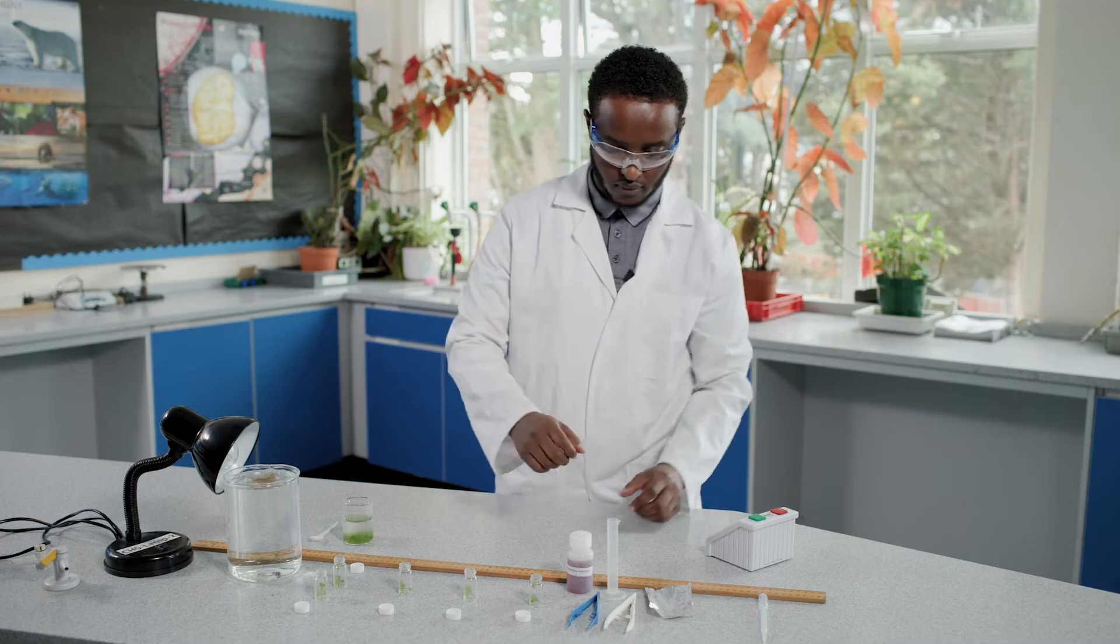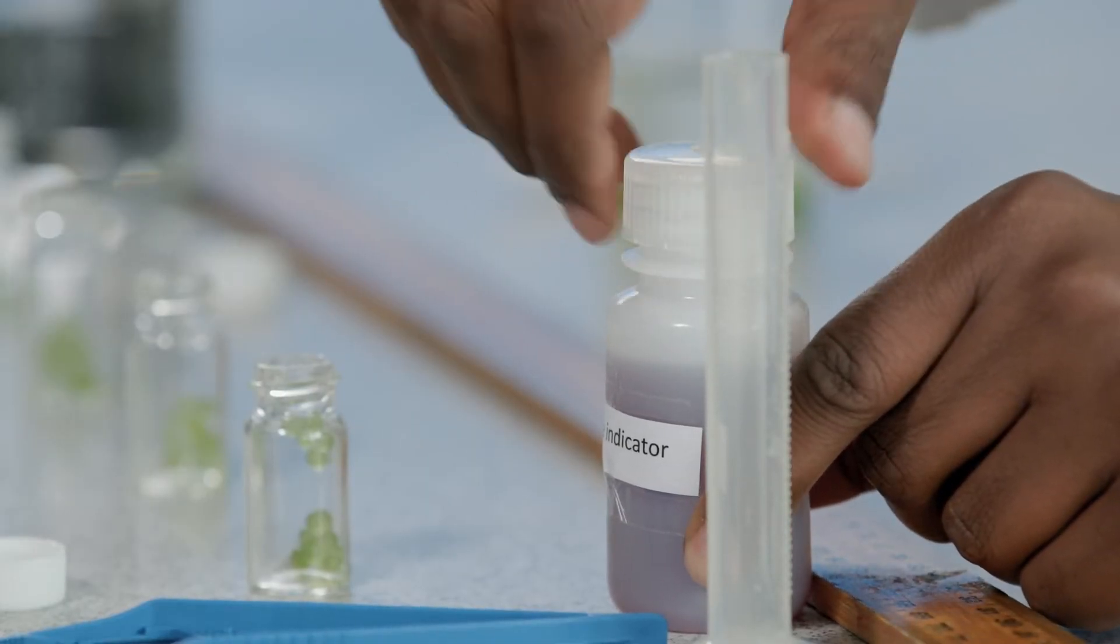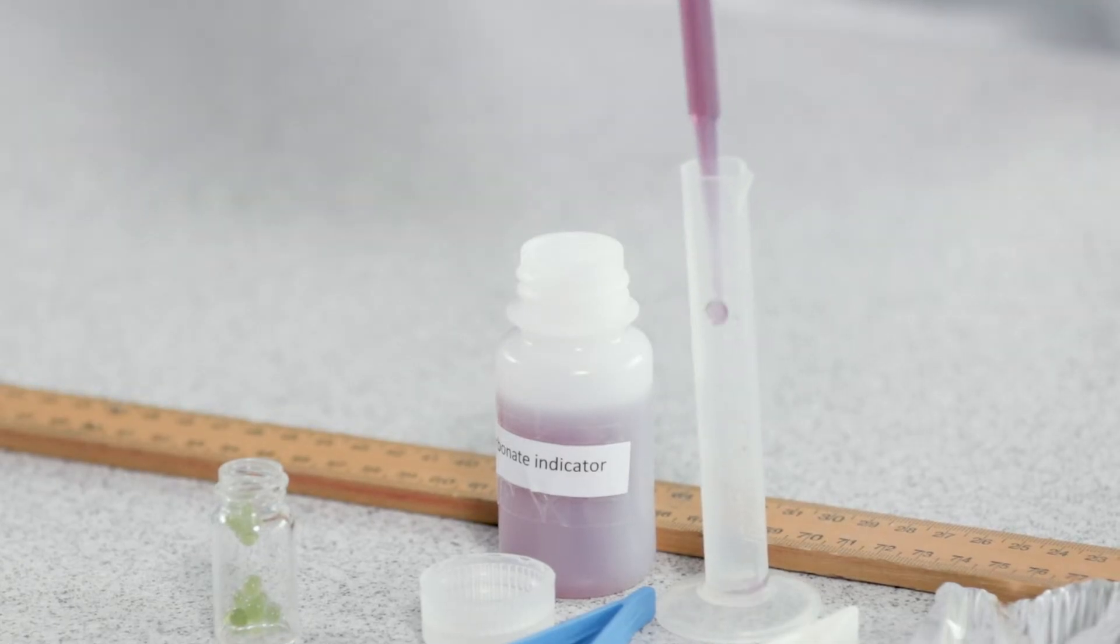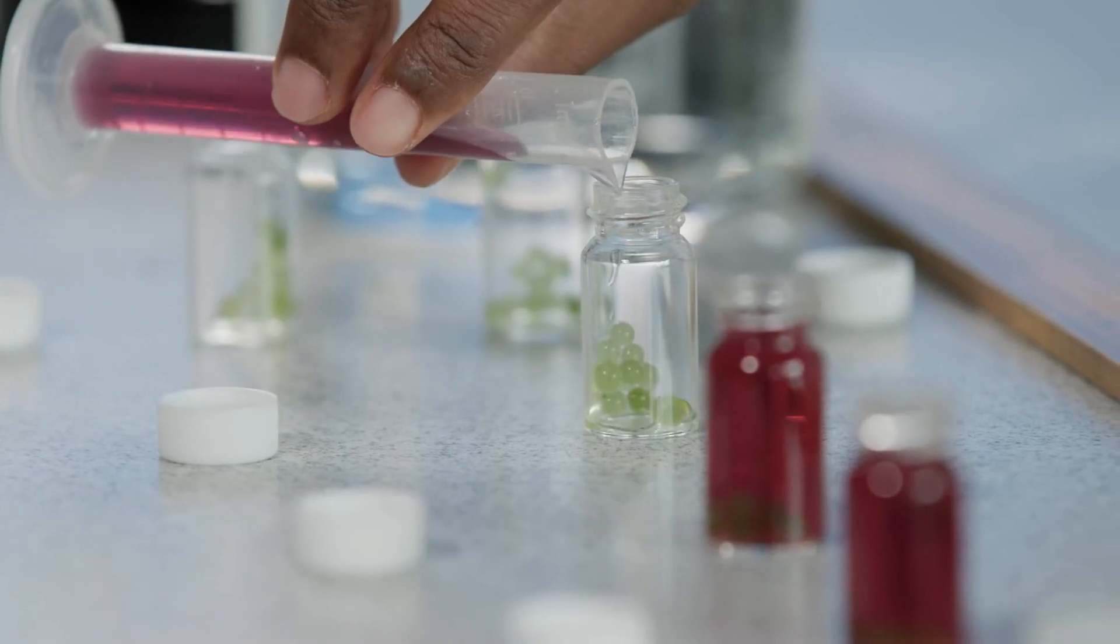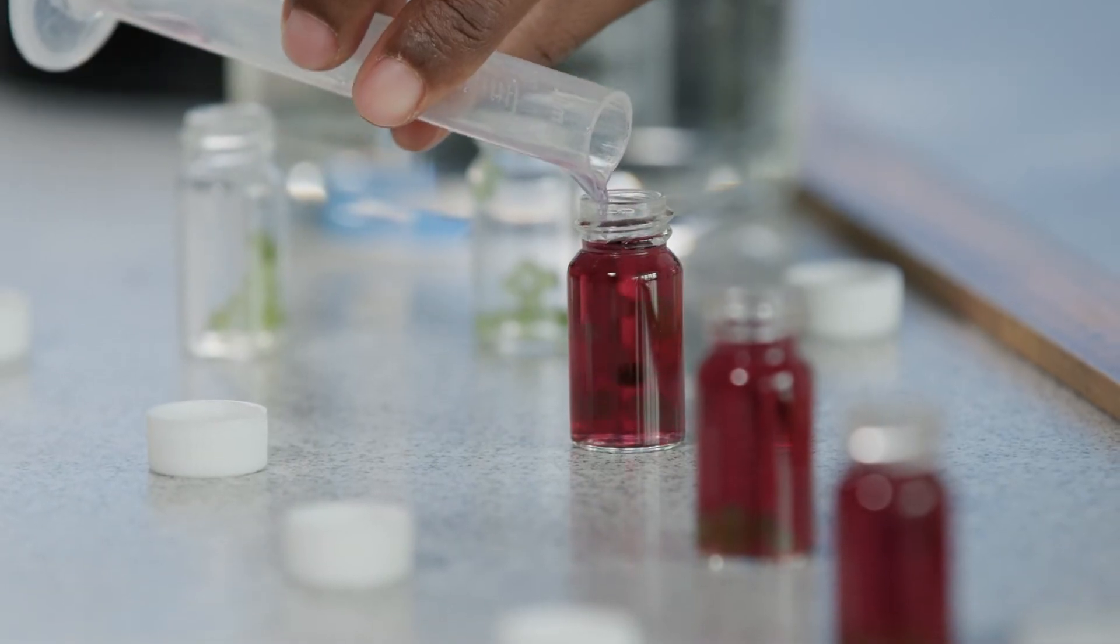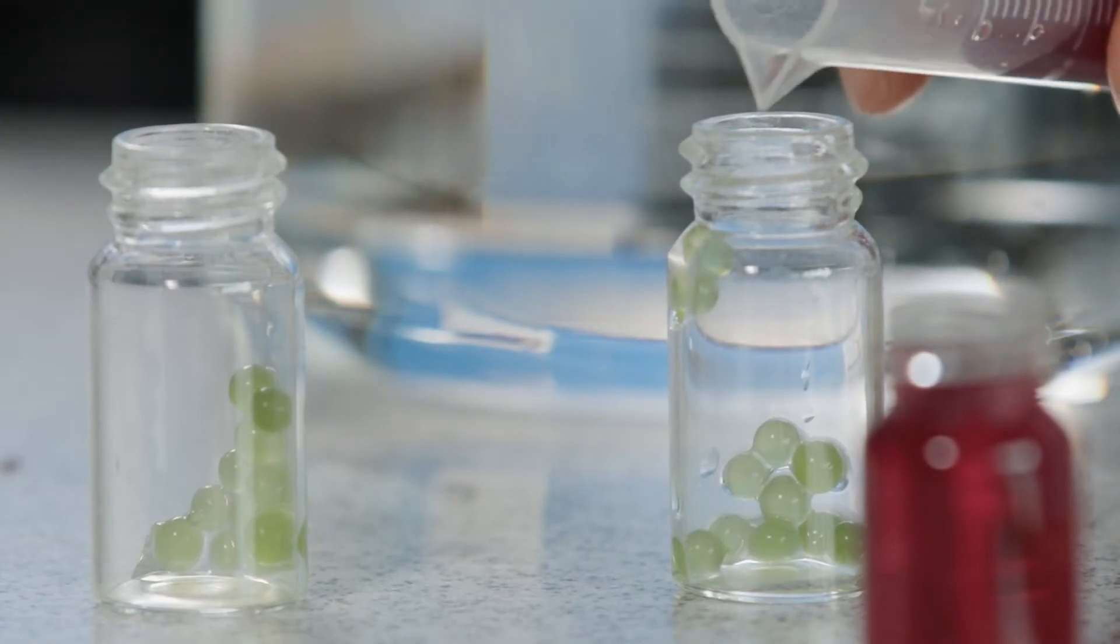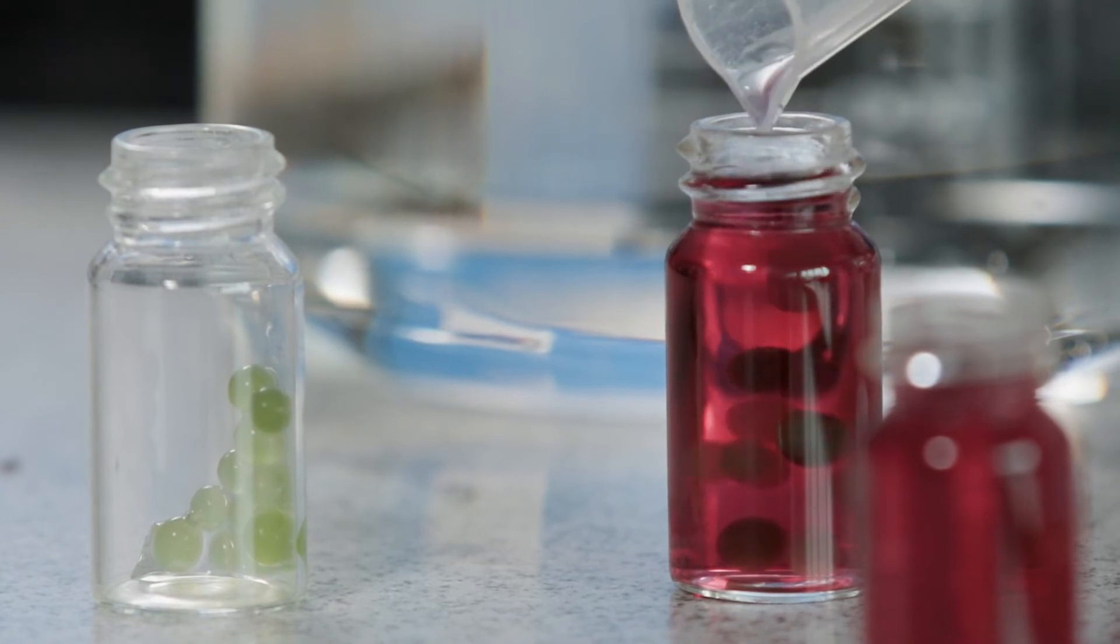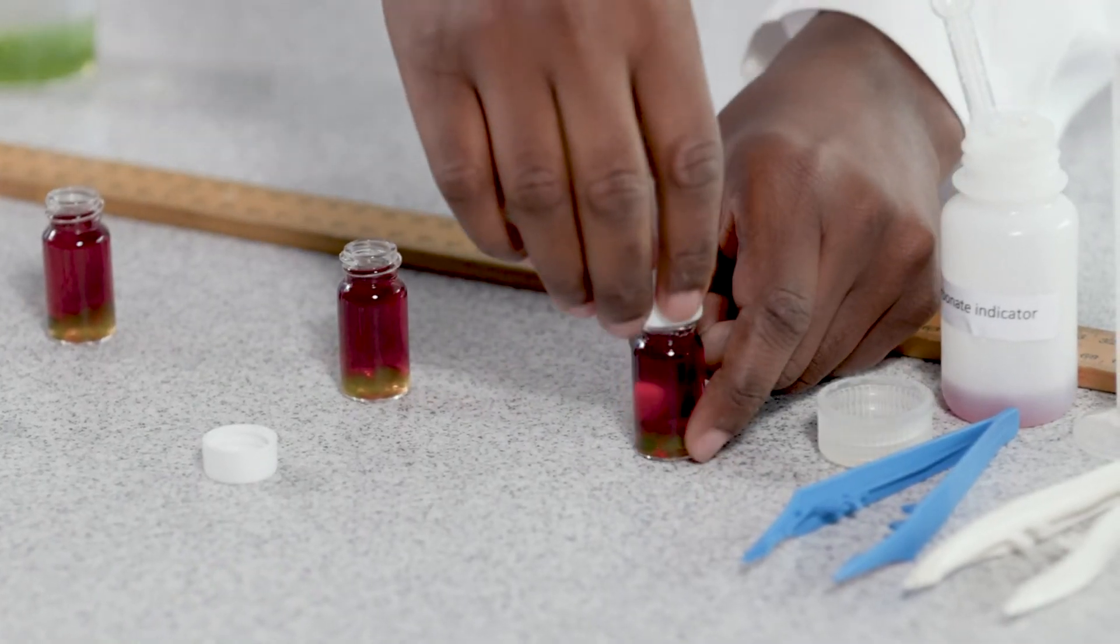Then add the same volume of indicator solution to each bottle using a measuring cylinder and pipette. Put on the bottle caps.